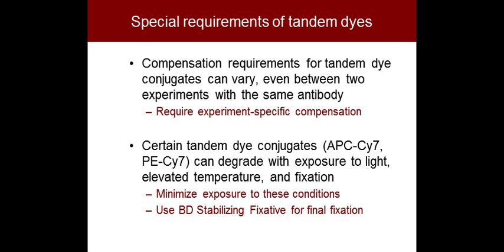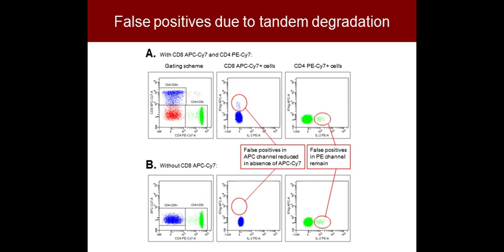There's a stabilizing fixative that's available that helps to keep that degradation to a minimum. So those are the caveats of the tandem dyes. And on the next slide, I'm going to show you an example of kind of the worst case scenario of what happens if you don't pay attention to these rules.